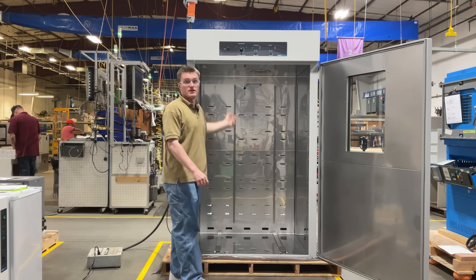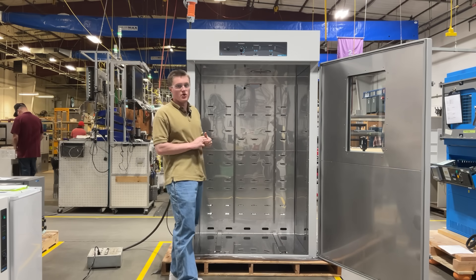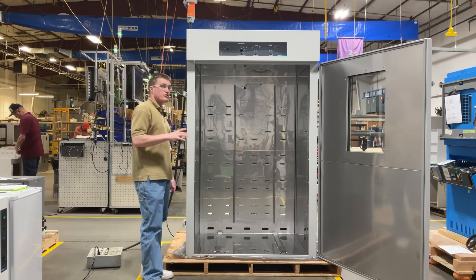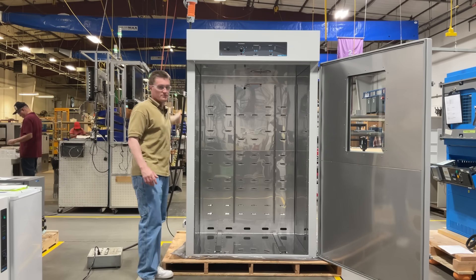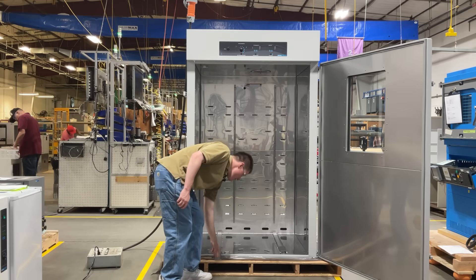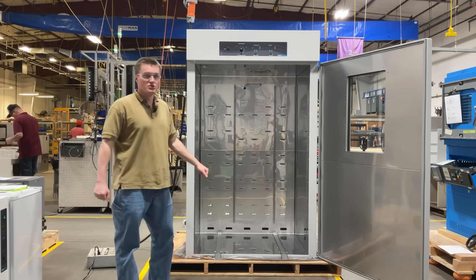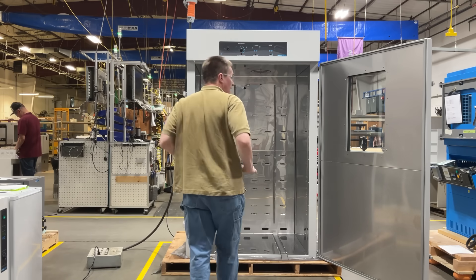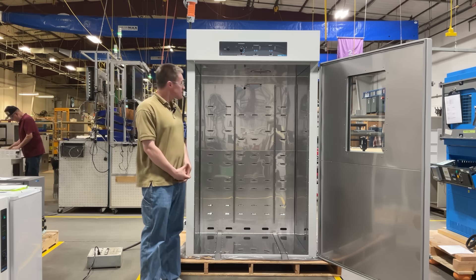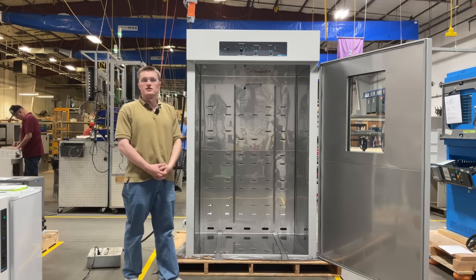On the top of the unit, you have an accessory power outlet. This allows you to power any auxiliary devices you want to have inside the chamber while it is running. On the left side, you have a one and three-quarters inch access port located here. Additionally, on the bottom is our door track feature, which allows you to roll carts full of samples in and out of the chamber. The chamber has been constructed out of corrosion-resistant materials to help increase the longevity of your unit.